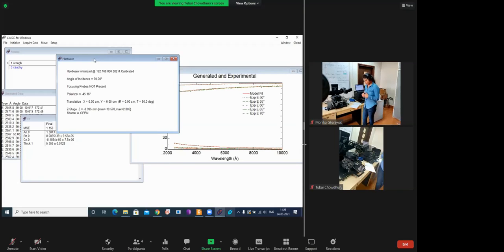So, what I understood from your question is you want to know whether we can get n and k, I mean refractive index, from these values? Yeah, for calculating those refractive indices from the wavelength, that's why these empirical models and their equations would be used. Correct, absolutely correct. So if we know enough of those constants that we can fit the model for n, then we can get the lambda and then fit it for k. Is it such an exercise that we can do with this model fitting?